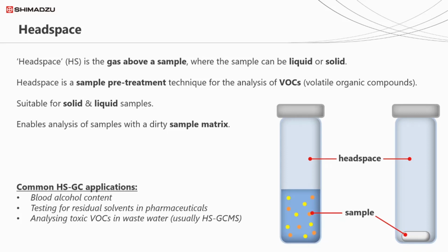Finally, Headspace is commonly used for the analysis of toxic VOCs in wastewater. These VOCs are tested within a matrix, predominantly of water, but also of some other content that I'll leave to your imagination.